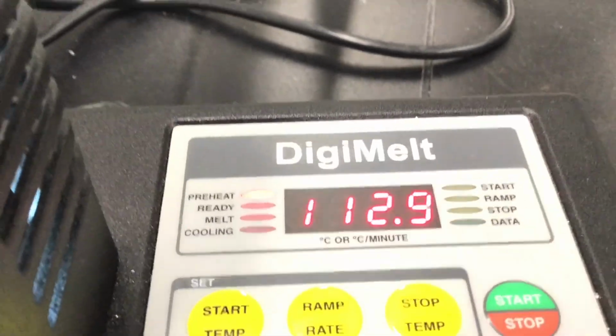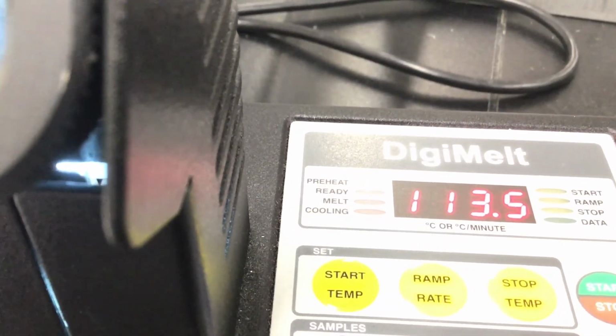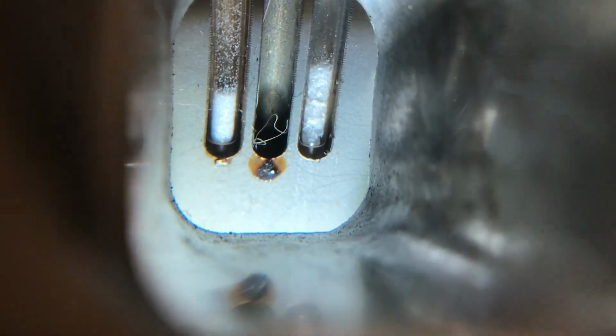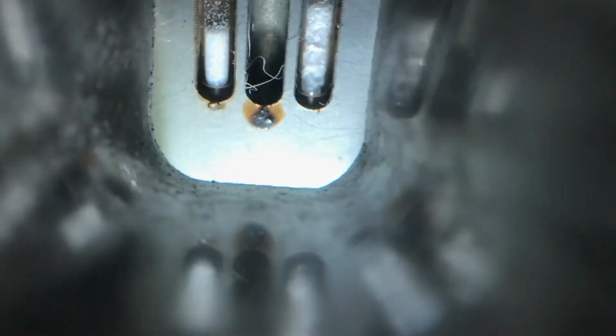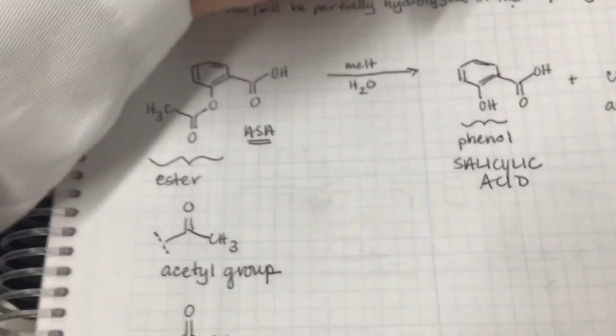So we're at 112. It's still climbing, but it's slowing down because it's approaching that start temp we reported. So I'm going to write on here.